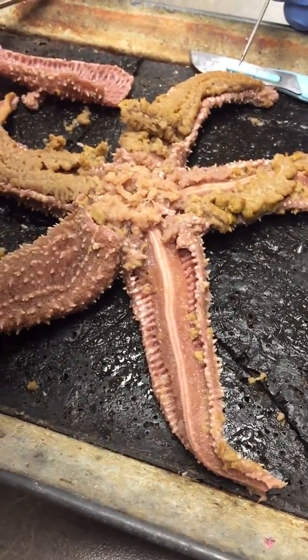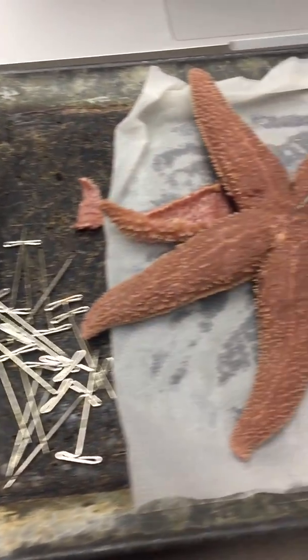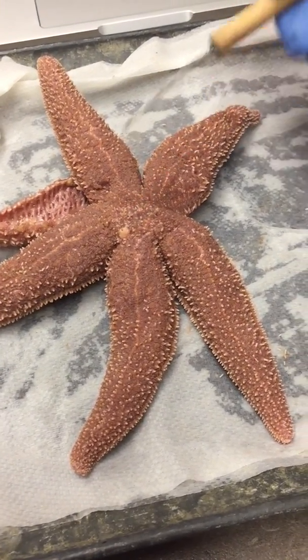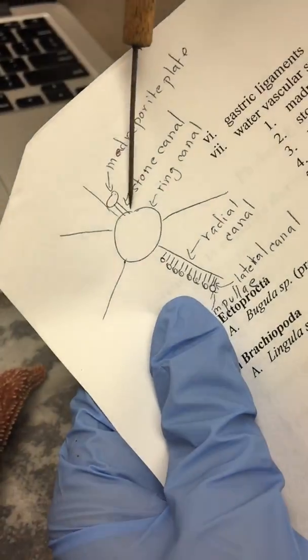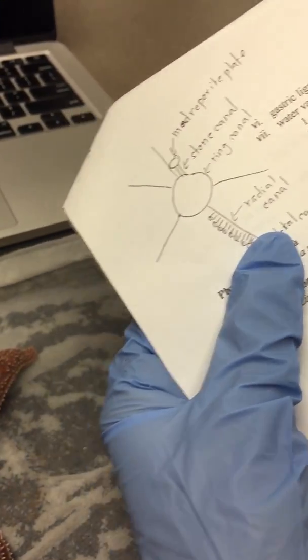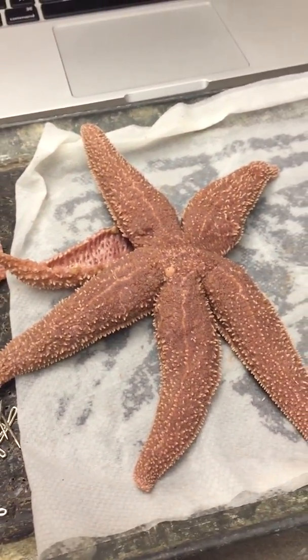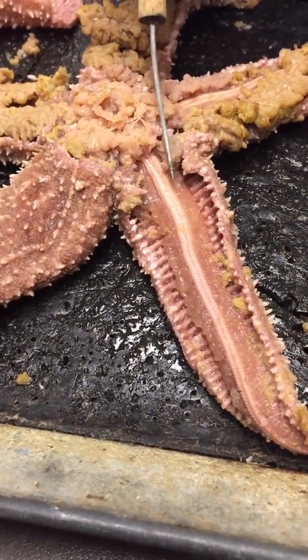Now we're going into the water vascular system. It first goes into the madreporite plate, then into the stone canal, which you can't see — but you can look at the diagram. Then the ring canal, which should be in here. After the ring canal, it goes through the radial canal, which radiates into each arm — there's one in each arm. The lateral canal goes this way but it's very small.